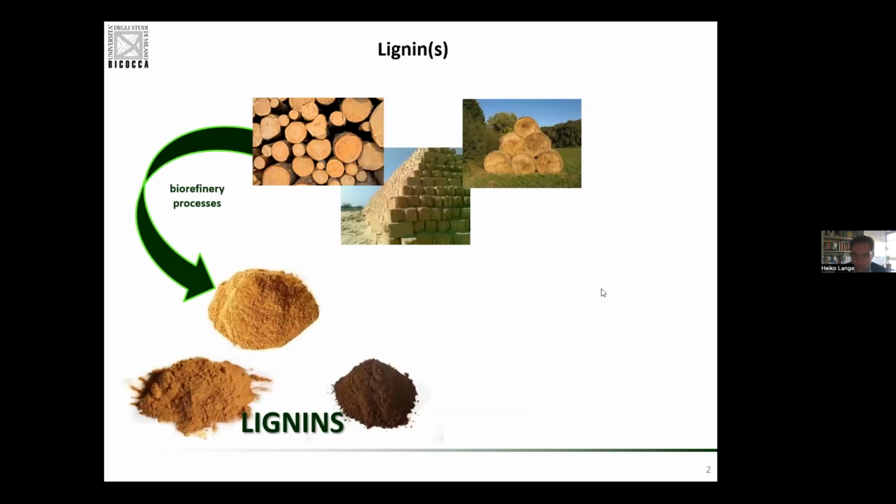First of all, obviously, let's recall a little bit what lignins are, because it's a very special type of natural product, and it will pose a lot of issues, as you will see. That is obviously important to know right from the beginning, because otherwise I might design my analytical approach in a completely wrong way. So the lignins that I'm talking about are coming mainly from waste biomasses like straw, or from trees directly, in form of lignins that come from paper industries, where the lignin is the byproduct from the cellulose production.